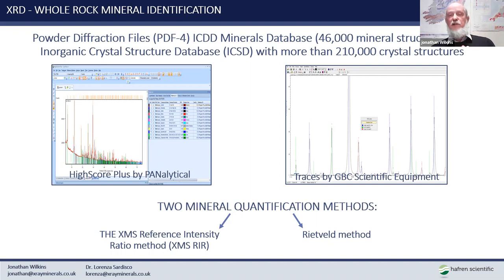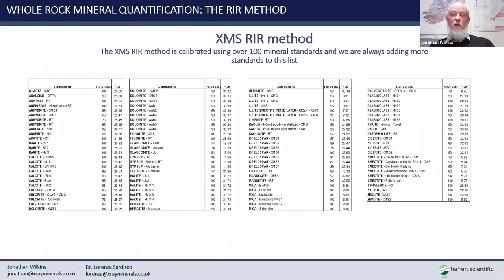And it will tell you how much quartz or clay there is in your limestone, how much gypsum there is in your mixture for making plasterboard, for example, or whatever else. And it does have specific advantages, not least because in order to properly quantify mineral abundances in real rocks, you have to do a great deal of measurement of standard materials, which are pure samples of the minerals which are going to be combined in your models for analysis.